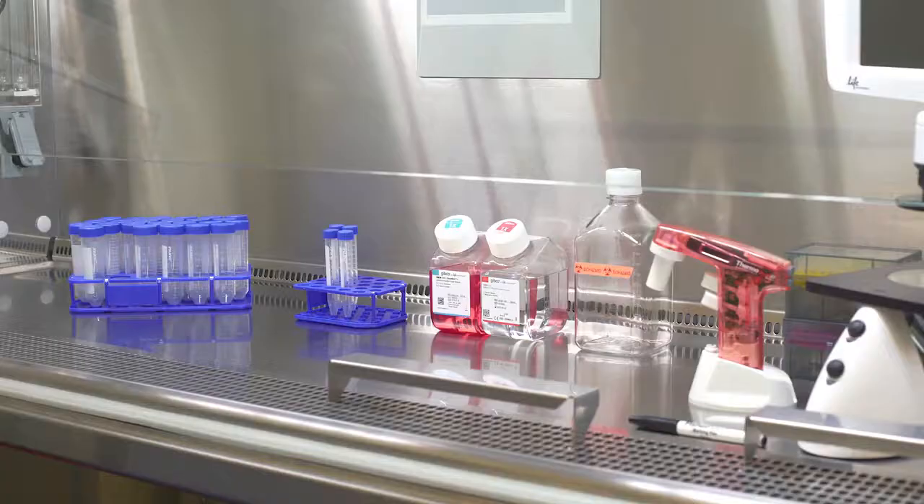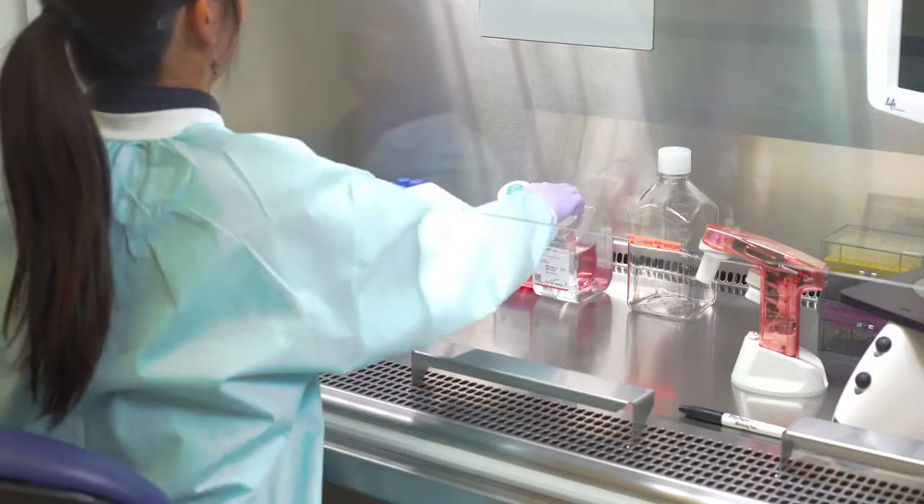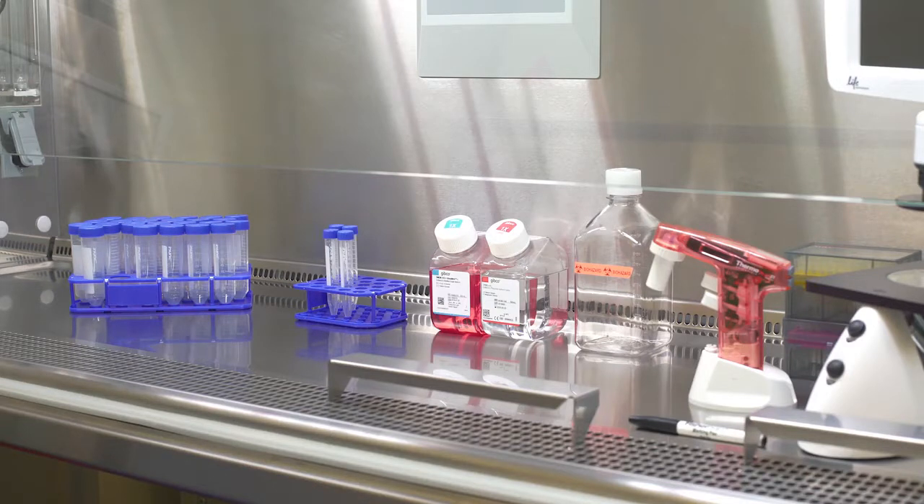As you clean the item and place it into the cell culture hood, put it in the correct position. Enter the hood with your hands in a forward motion and try not to sweep across the front and disrupt the airflow. Proper setup of the cell culture hood includes not overcrowding the work surface. Not only does this increase the risk of contamination through accidental touching, but it also interrupts the airflow through the chamber, which will not maintain the sterile field.